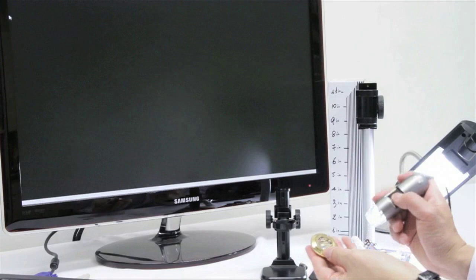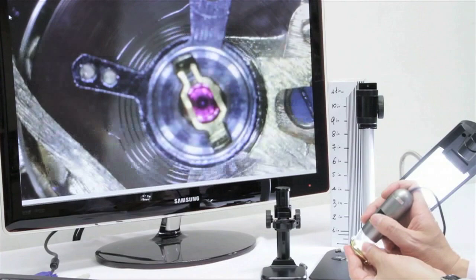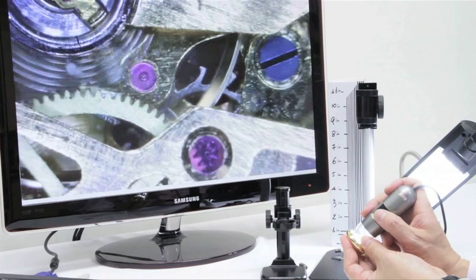For our next example, we're using a watch. When getting into focus, it may be easier to focus at 50 times and then move down from there. It's easier when you have a larger field of view.